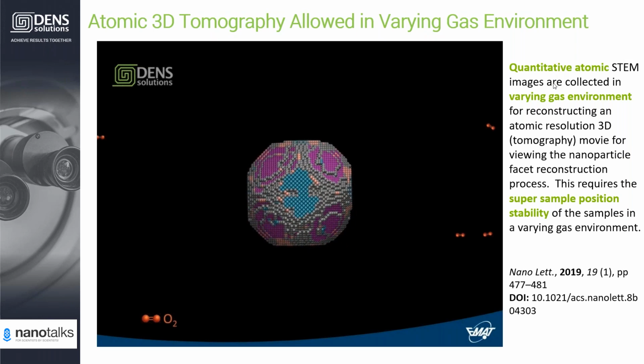All right, stepping to the next question, a very brief question that I see here. Is the holder specific to only JEOL TEMs? No, that's not the case. We're also compatible with Thermo Fisher microscopes. And then we have another question that says, have you looked at the influence of the electron beam on the metal oxidation state and reaction? And how do you find any difference when you are doing the reaction with and without TEM?